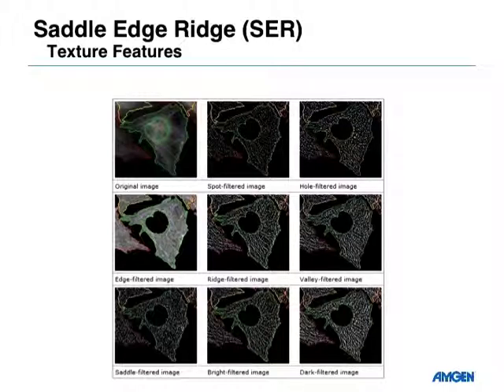And then you have things like you could look for spots or things that look like ridges or things that are bright or dark. And so it's looking for these different types of features. And so one of the things that happens, though, is as you start to look at these particular features, say if you're looking at mitochondria or tubulin, things that are very fine structures, what you want to do is have a kernel size that's very small. If you're looking at larger objects, maybe vesicles, or things like ER, you might want to have larger kernel sizes, because you're looking for something larger.